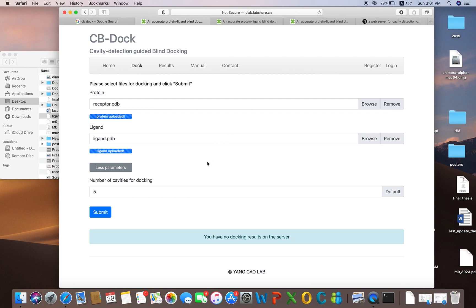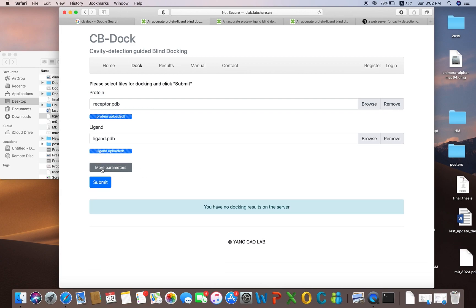You can upload any structure of the protein that is present in the PDB — you can download it from the PDB as well. If you have modeled your own protein that has not been reported yet, you can upload that protein as well. You can also upload any ligand which you have designed or sketched in different software.